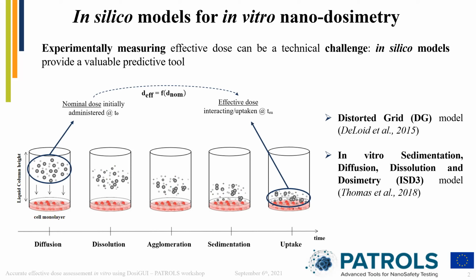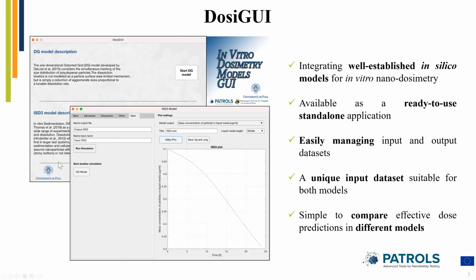In particular, two models have been established during recent years for in silico nanodosimetry, which are the DG model and the ISD3 model, which are able to reliably simulate the dynamics of nanoparticles suspended in an aqueous medium.